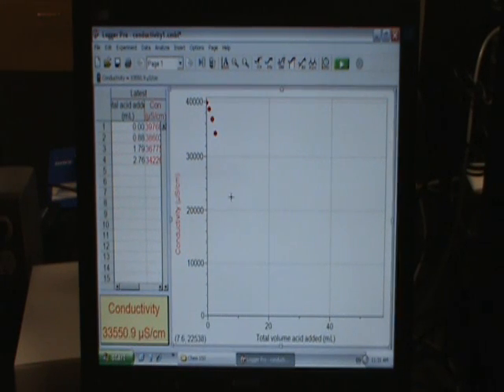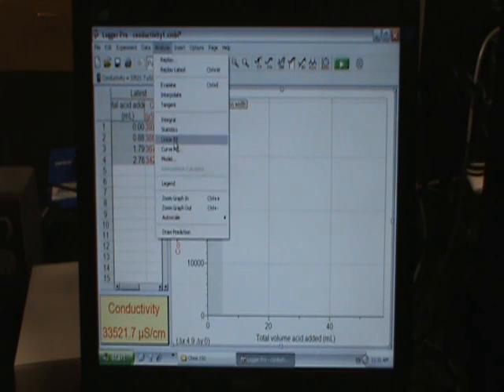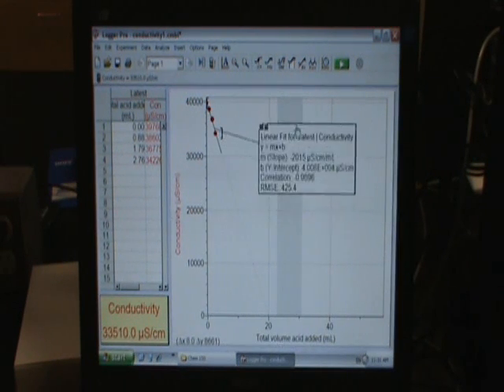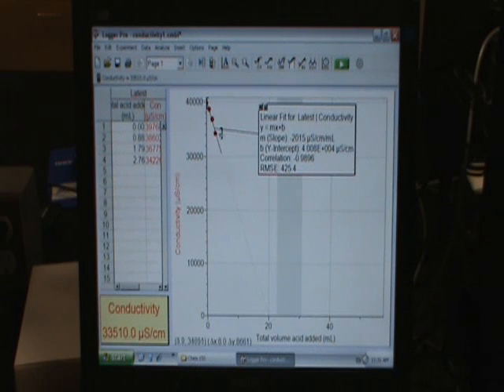Another tool that might be useful when you're looking at your data within LoggerPro is, let's click and drag to highlight. We could highlight all of our data or just a portion of our data. Go up to analyze and linear fit and, let me grab that, LoggerPro will fit the data that's between the two limits. So, you see these two square brackets? Those are defining where I want my linear fit. So, this gives me a linear fit, y equals mx plus b, with correlation as an r squared type of value.